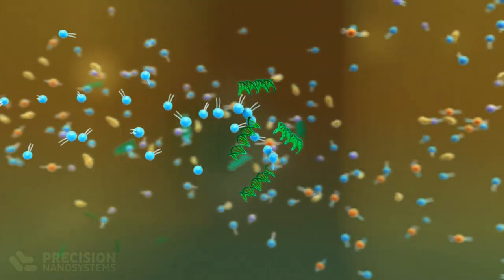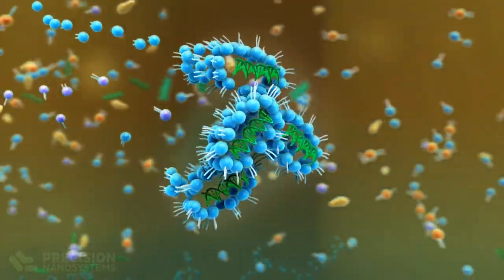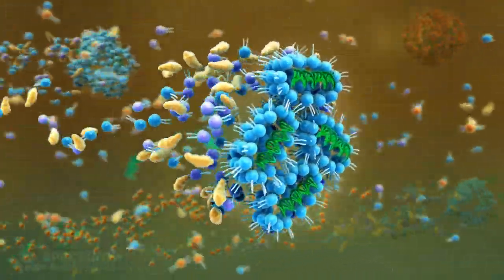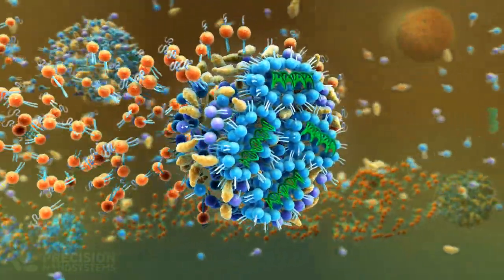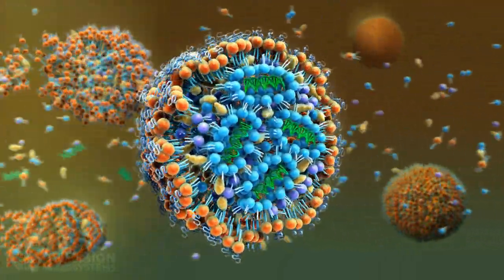the cationic lipids complex with the negatively charged nucleic acids to form the beginnings of the particle core. The helper lipids aggregate further as they come into contact with the aqueous solution. Finally, the PEG lipids orient themselves on the surface, with hydrophobic tails pointing inwards.